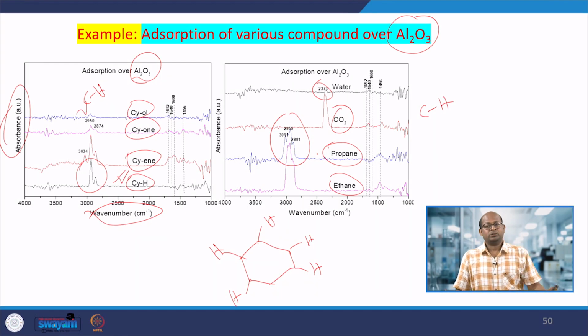Okay, so thank you. Today is up to this. We have studied IR spectroscopy, and how IR spectroscopy, that is FTIR spectroscopy, can be used to characterize different functional groups present in any molecules, hydrocarbons or nanomaterials that we are going to study. Suppose we have prepared fullerenes, various hydrocarbons, or various carbon nanomaterials, and then we change their properties by functionalization.